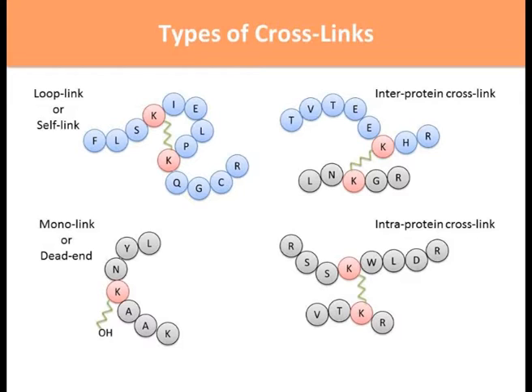They also have these monolink or dead-end peptides where the cross-linker has hydrolyzed and therefore is inert. And this is like a typical peptide with now a differential modification on it. There is no pairing for this cross-link here. Then finally, we have the cross-links themselves. And these are what researchers are most interested in.